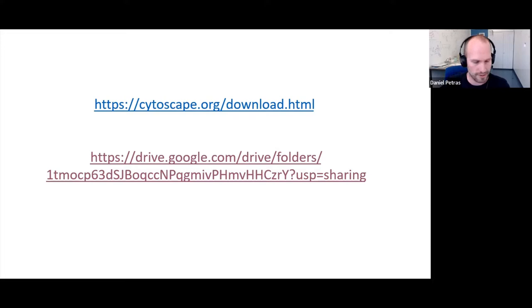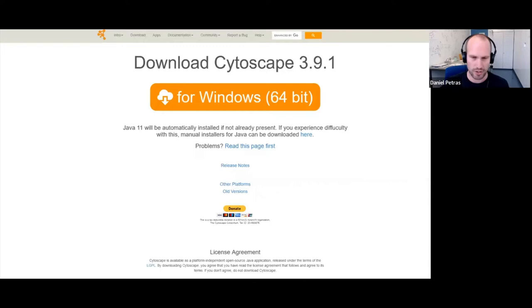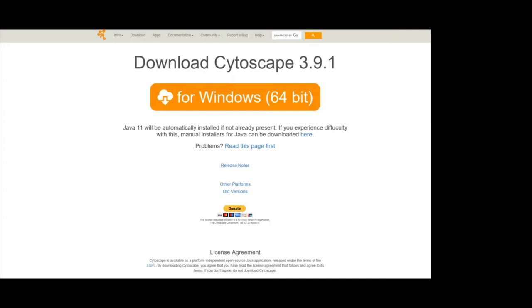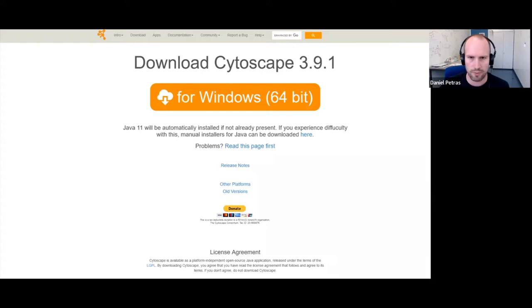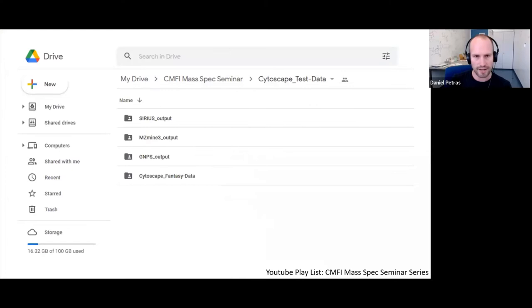You just get to the page and there's a big download button. There should also be a version for macOS and Linux — you may have to dig a little bit deeper, but it's relatively straightforward. It's also widely used, so a lot of people put a lot of effort into it. Under the second link, there are four different folders.